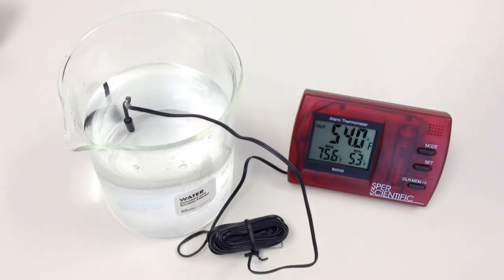Model 800-042R features an internal and external temperature sensor mounted on a nine foot long cord. The sensor is waterproof and can be used outdoors or in liquid.